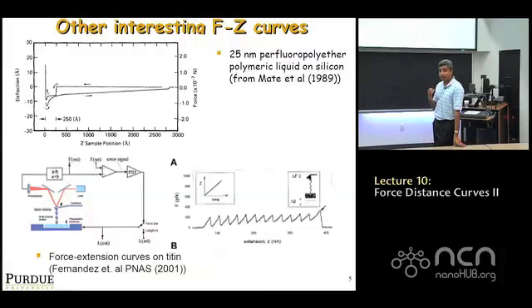So, Cappella and Kappl, and Butt, they really lay out very specific terminology. They call it Z piezo displacement. In the literature, you'll see the Z referred to by all kinds of names. Some people will call it gap, tip sample gap. It's not tip sample gap, as we've discussed. Tip sample gap is D, right? But some people will call it, in this case, sample position.